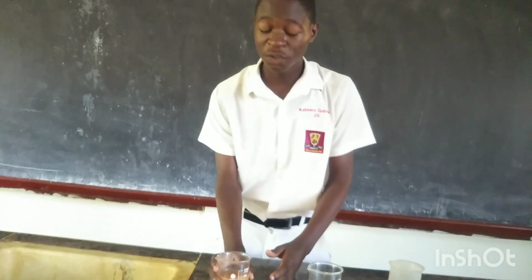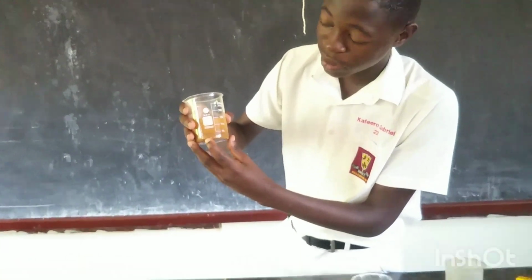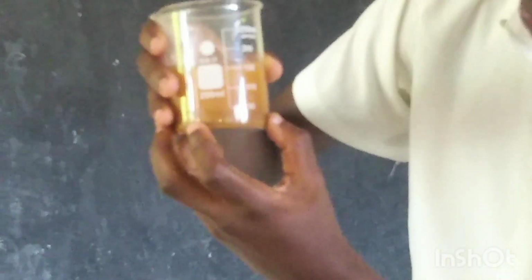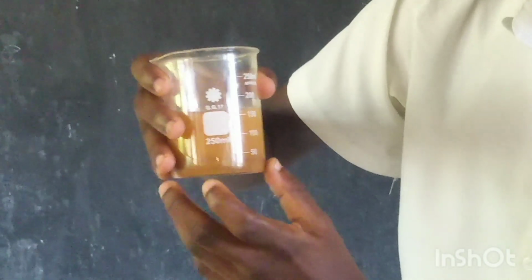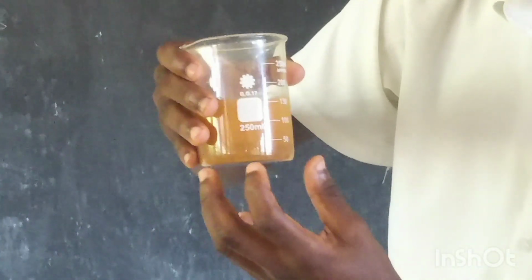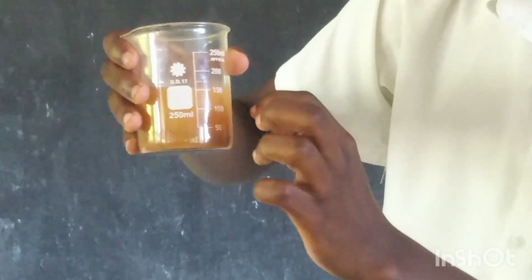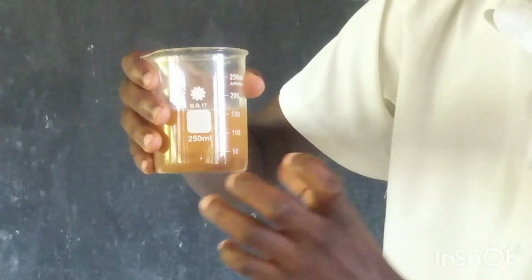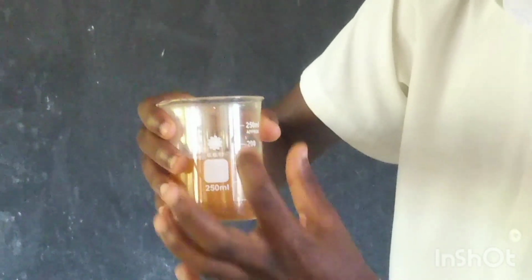So as you can see, you can zoom in here so they can see properly. This sand here, you can see the layers formed. We have about three layers. We have the first layer, that is the layer of the sand, at the bottom. We have the second layer here. It's a bit dark, meaning that layer contains some sand particles. And we also have this upper layer of water.